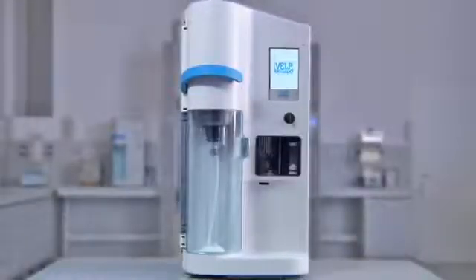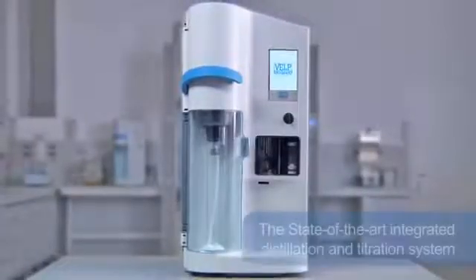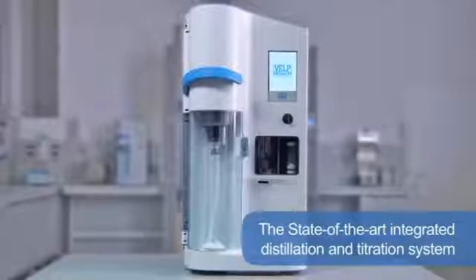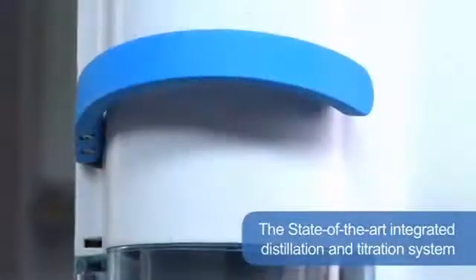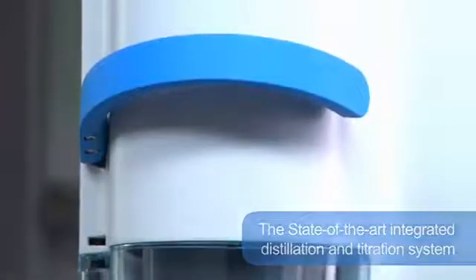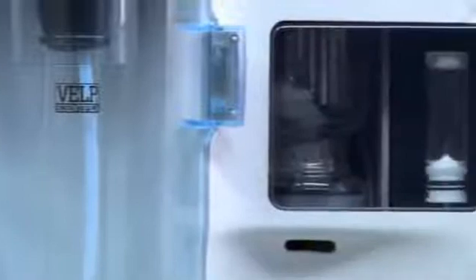The VELP UDK 159 represents the state-of-the-art integrated distillation and titration system. It is designed to satisfy the most demanding laboratories needing high productivity and following high safety standards. It combines both distillation and titration in one fully automatic integrated system.